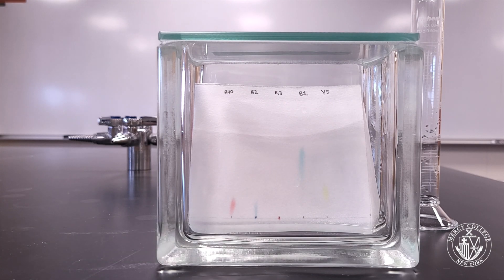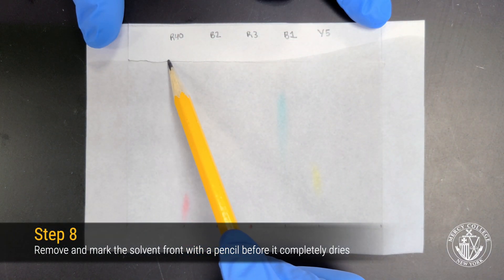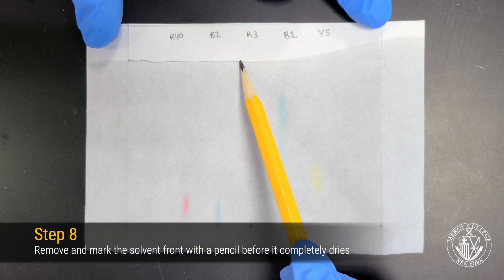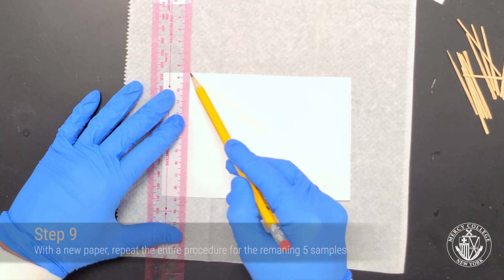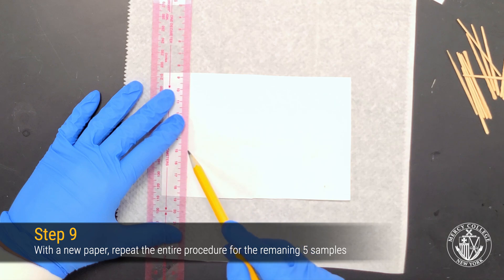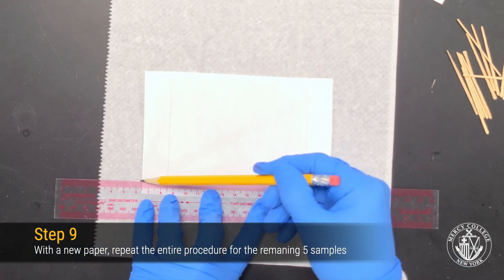Once the solvent front is within about 2 centimeters of the top of your chromatography paper, remove your chromatogram from the developing chamber. Then mark the solvent front before the solvent completely dries. Now we're going to repeat this process for our second set of five samples, which will be our three food coloring samples and two unknowns.